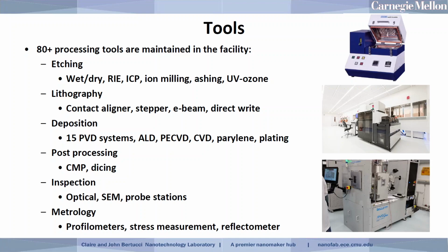Just looking at the images, I picked out a couple of images of some of the newer capabilities in the lab. So this is the UV ozone cleaner, this is the ASML stepper, and this is our Lesker evaporation tool. All of these were pretty new when we first opened the facility.